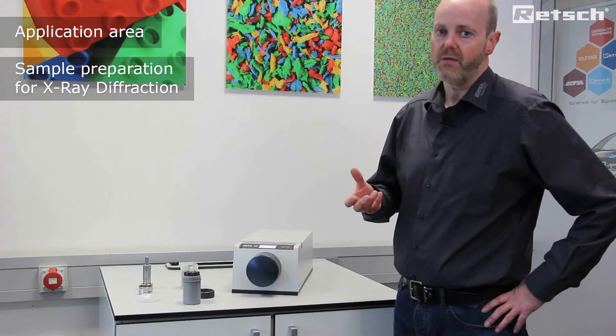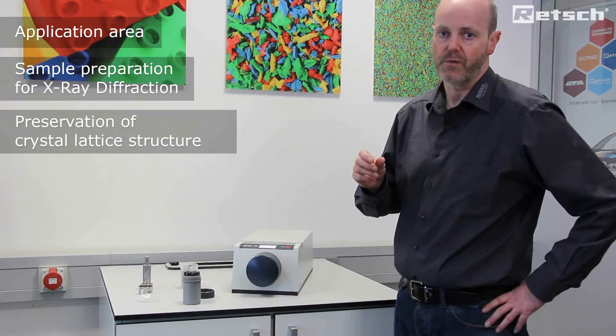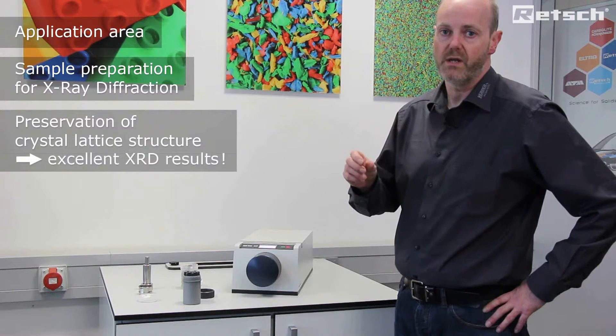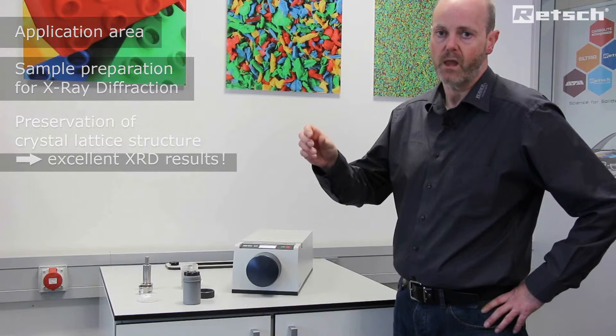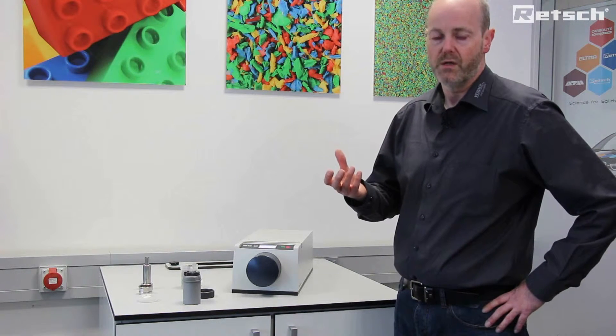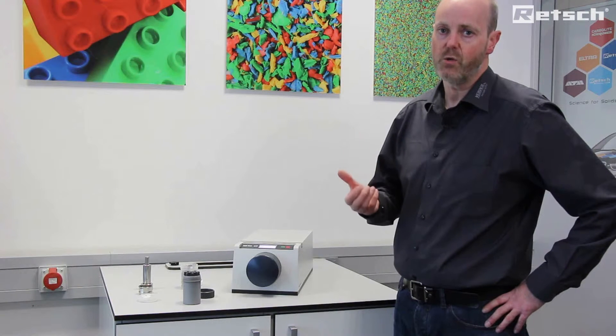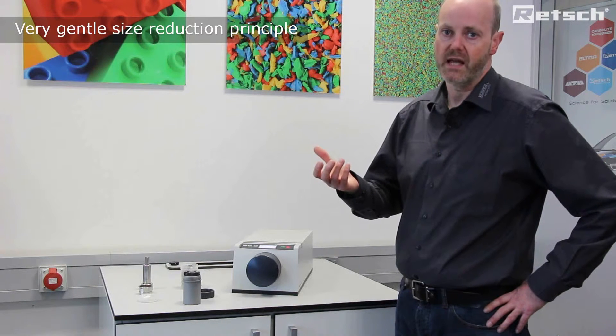The key point about this is the preservation of the crystal lattice structure, which will determine excellent results on the XRD analyzer. With many other instruments, including other ball mills, the modus operandi is far too aggressive and will destroy that crystal lattice, and therefore it won't be detected in the XRD analysis.